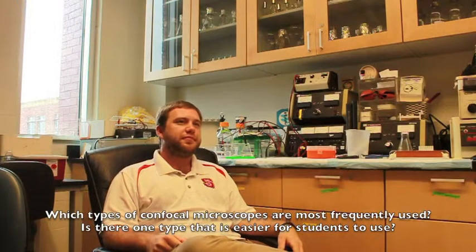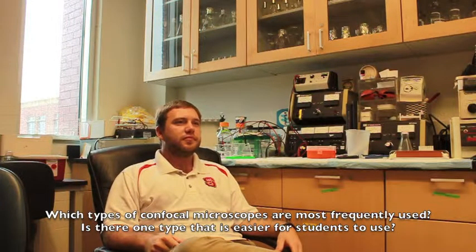So which types of confocal microscopes are most frequently used, and is there a certain type that's easier for students to learn to use over another? So most frequently and arguably better is the laser confocal. However, in my experience, the spinning disc is actually a bit easier to use.